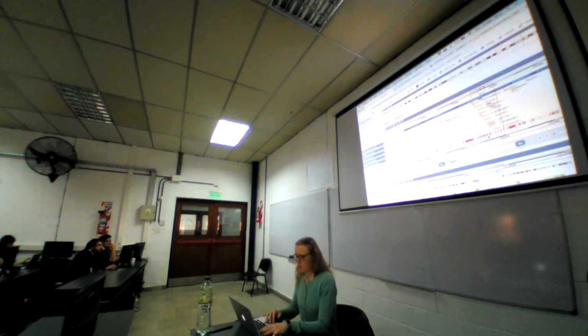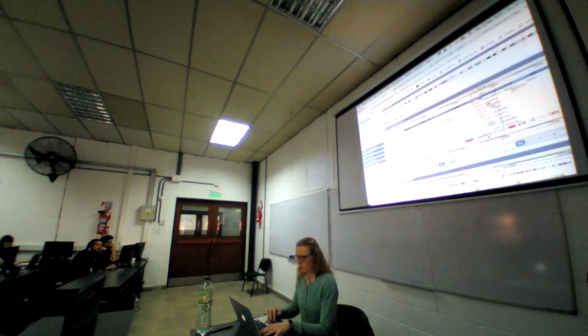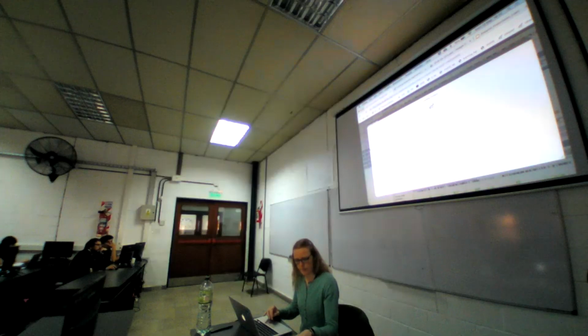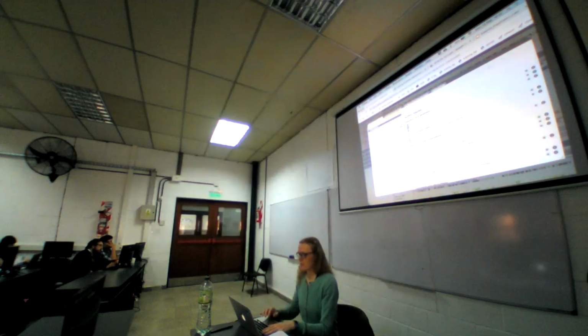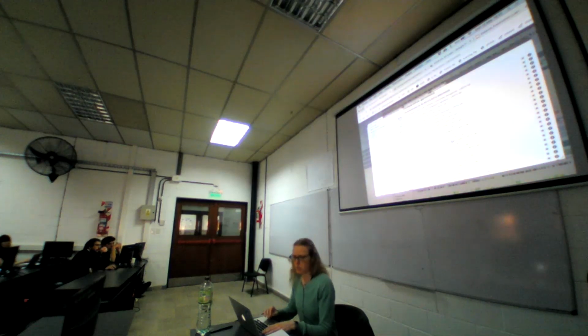What I'm going to do is I will focus on this third picture, the detailed view here, and I will add a couple of alignment tracks now. So for this, I'll go to configure this page. Then I'll do a few things at once. I'll go to the alignments section here, BlastZ and LastZ alignments. And I will add alignments for some species.